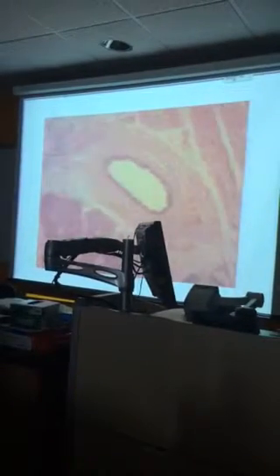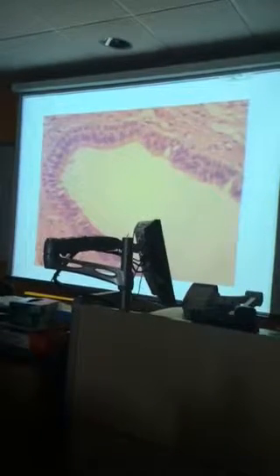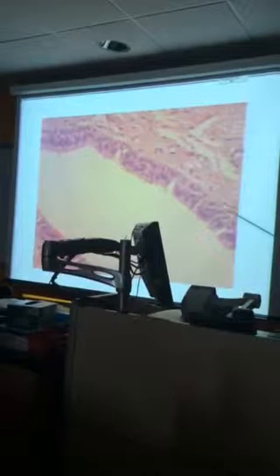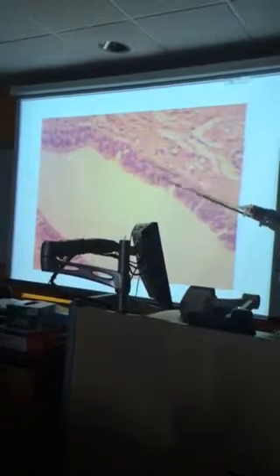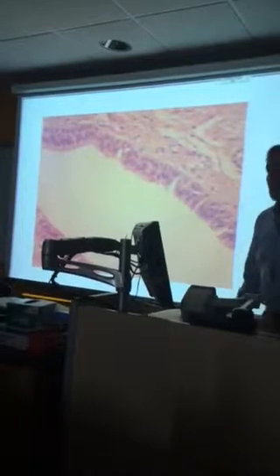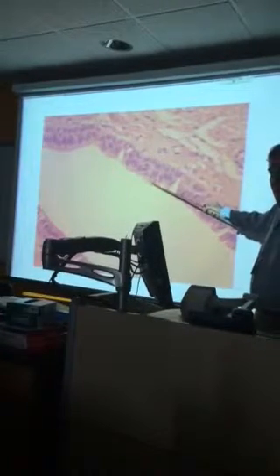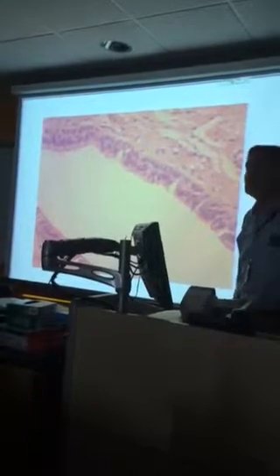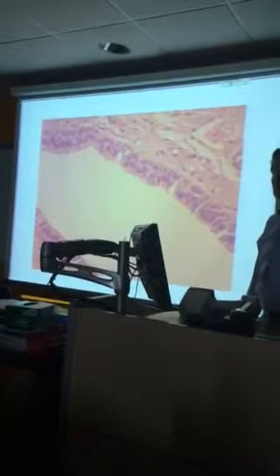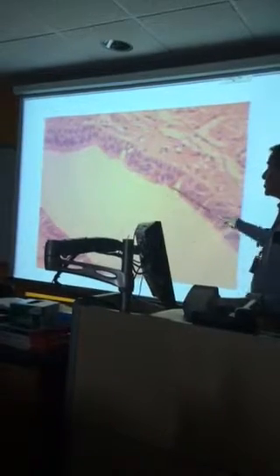And then right next to it, we have something right here. We're going to look at the wall. And now you can see it's definitely got a different epithelium than that in the vein. This is not simple squamous. You can see you got layers of oval nuclei, which indicates what kind of cell? Columnar. This is an example of stratified columnar epithelium, which is rare in the human body. But one place you do see it is in the large salivary gland ducts in the submandibular salivary glands, like we see right here. And this is quite clear.